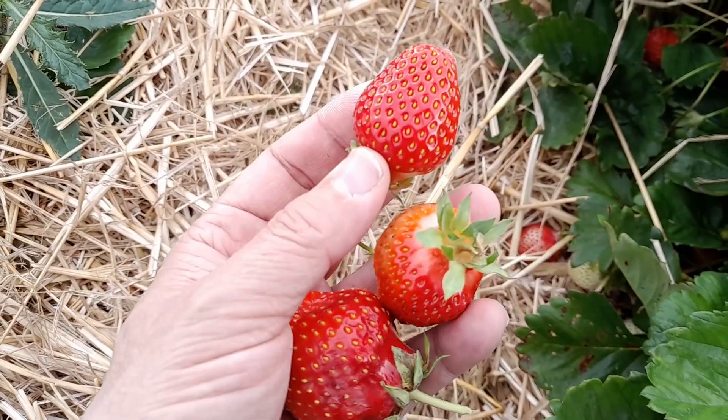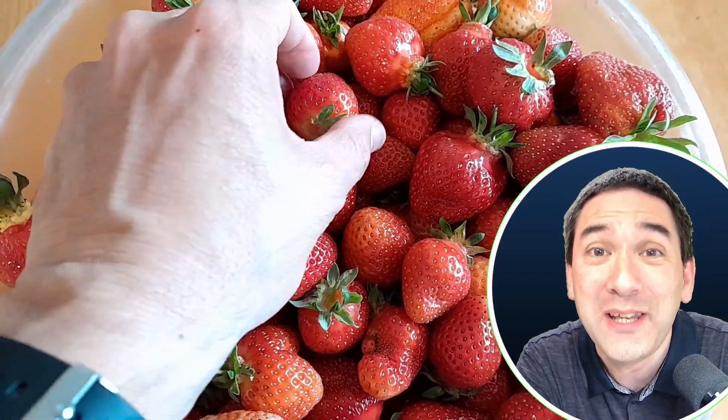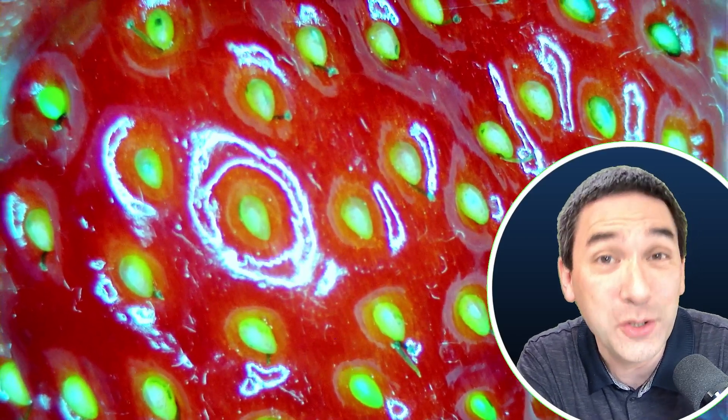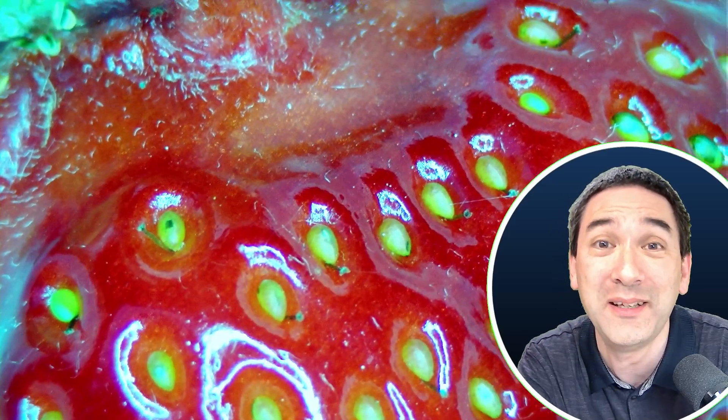I'm going to start now at the very beginning. I recently visited a strawberry field where the concept is pick your own strawberries — you pick as many as you want, you pay for them, and you're also allowed to eat the strawberries directly from the field. I, of course, was more interested in putting them under the microscope, and so this is basically what I did. I took one of the strawberries and put it under my stereo microscope.